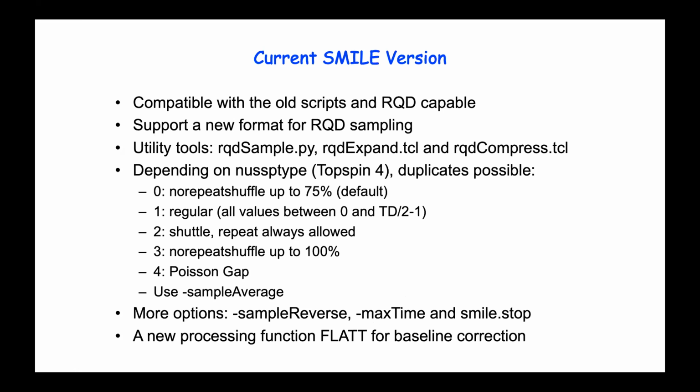These are not considered because SMILE doesn't know beforehand how much time it needs. And there's also SMILE stop. If you run a long 4D, and it takes a long time, but you feel like it's enough, or you want to see the data as it is now, you can just create an empty file like this.